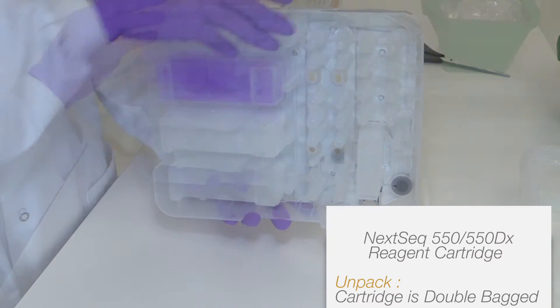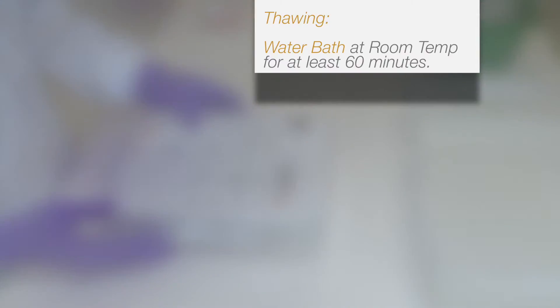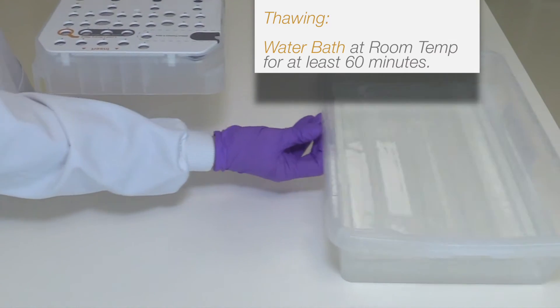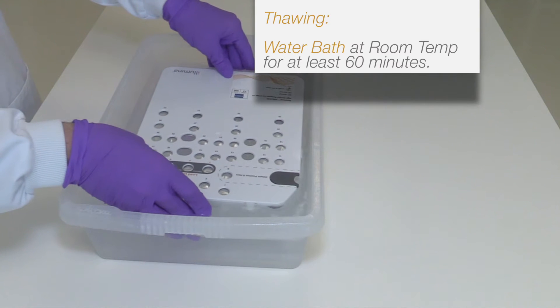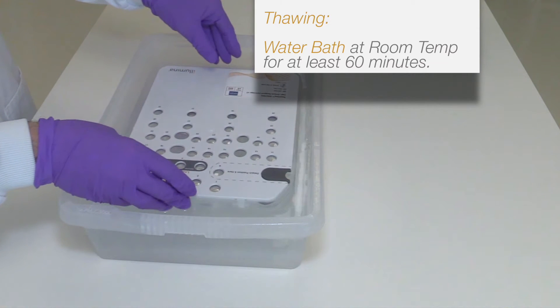Place the cartridge in a room temperature water bath until thawed. This should take at least 60 minutes. Please note it is important to not submerge the cartridge. An alternative method is to thaw the reagents overnight for a minimum of 18 hours at 2 to 8 degrees Celsius.